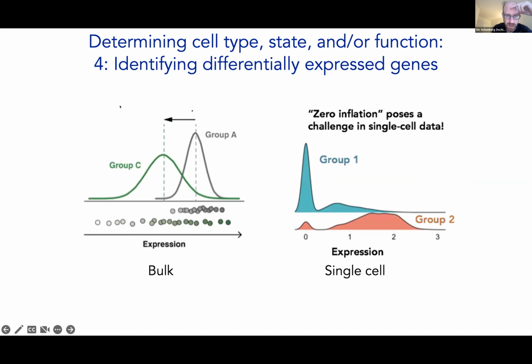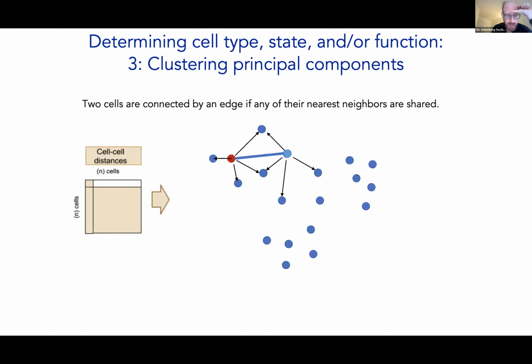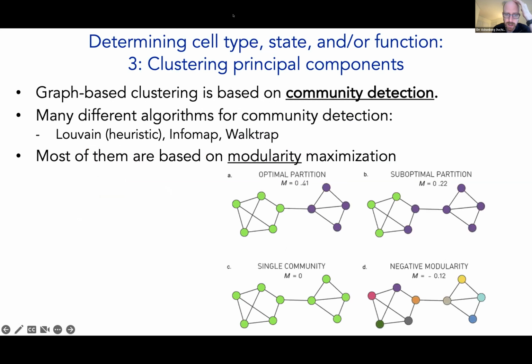Isabella, the distance metric is usually quantifying similarity. If 2 cells have very little distance, that means they're similar. And if 2 cells have very big distance, that means they're dissimilar. The distances are calculated in principal component space. So when cells are nearby one another in principal component space, that means their principal component scores are similar, which means they are similar cells. And if the principal component scores are very different, that means they're very different cells. And the principal components are just reflecting different gene programs. Any other questions? Thanks for the question, Isabella.